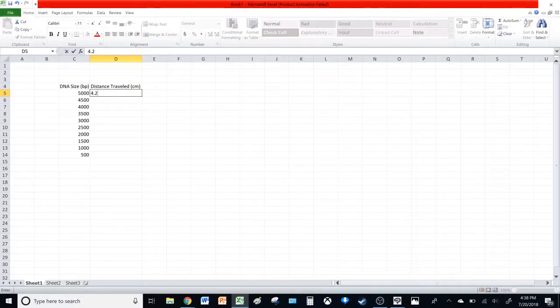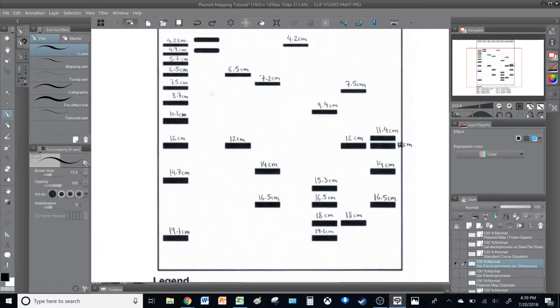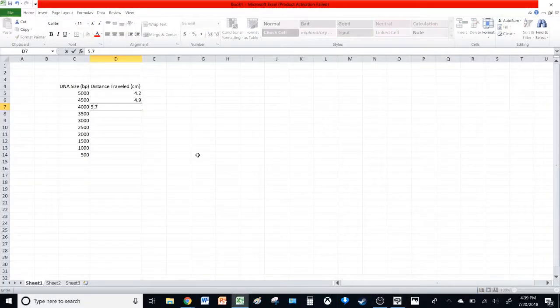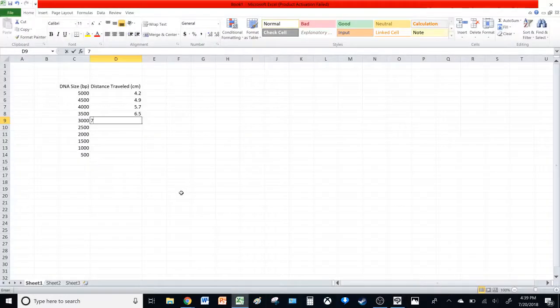So this was 4.2, 4.9. This was, I forgot, I'll have to check. 5.7, 6.5, and 7.5, 8.7, 10.1.